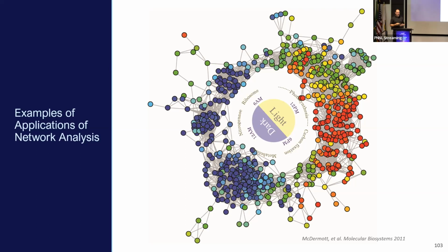And so we were really trying to capture what were the patterns that were happening of gene expression over time in these light dark cycles. Now, the interesting part is this is a great example of where you're using something like network inference. With the modern methods, you might not even call this network inference. To really visualize interesting things that are going on in this cyanobacteria.